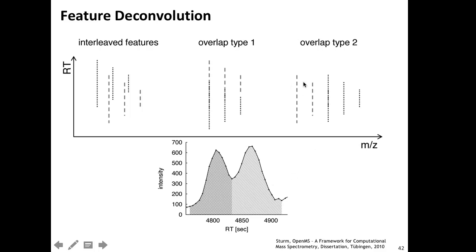What can also happen is that they co-elute either by accident or because they have a modification that is chemically still similar. It can also be some labeling. But the higher mass traces of one coincide with the monoisotopic of the next one. And that is where the model fitting helps, because the model would then fit also the other mass traces and would reduce this interference effect.